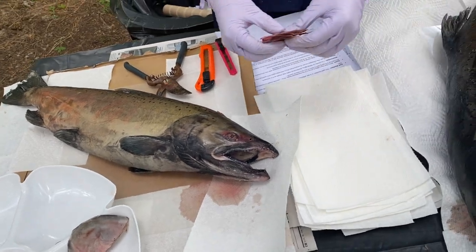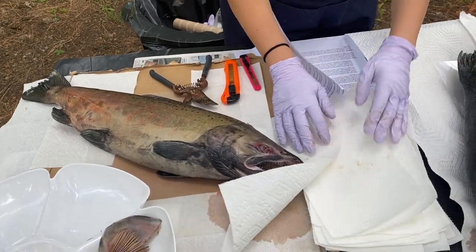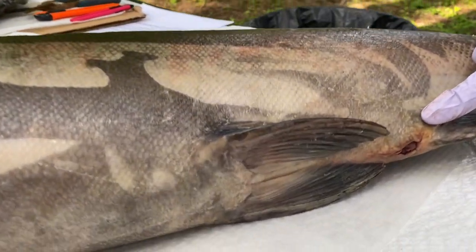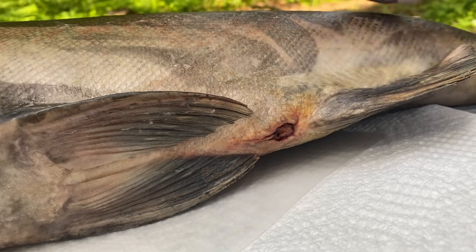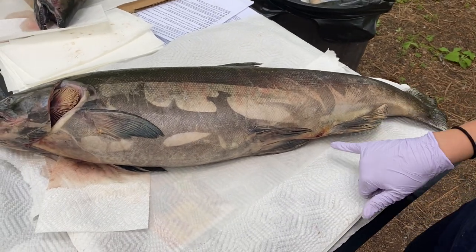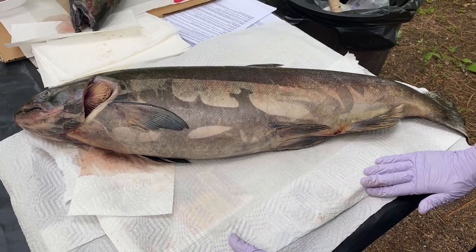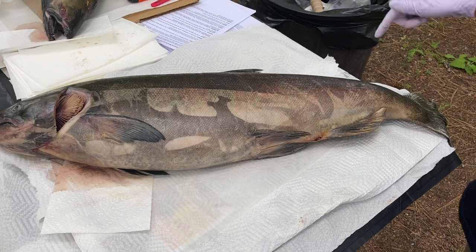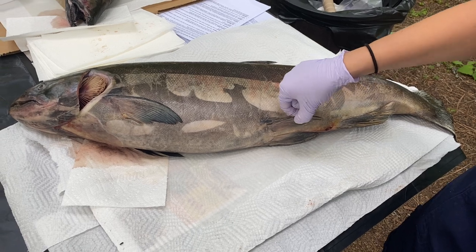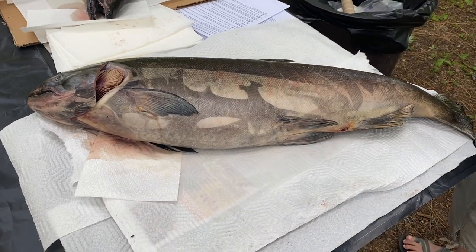So that is the full external anatomy of the salmon. And oh, I forgot one part actually. The salmon have an opening on their bottom here, and this is called the vent. The vent, or the urogenital opening. So any waste that the salmon produces from liquids or from eating is going to be expelled through that opening. And it's also going to release the reproductive, either the eggs or the milt, which will come out of the vent as well. And so when I do the internal anatomy of the salmon, I'm going to start from the vent, and I'm going to cut in between the pelvic fins all the way up to the pectoral fins, up here to the chest area, and then we'll explore the inside.